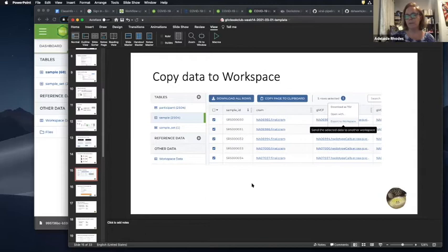the metadata for your 1,000 Genomes data, the 1,000 Genomes high coverage data set, and you're going to bring it in and be comparing to samples you already have in your data table from the low coverage. Be careful, because the data tables are sensitive to the column names.